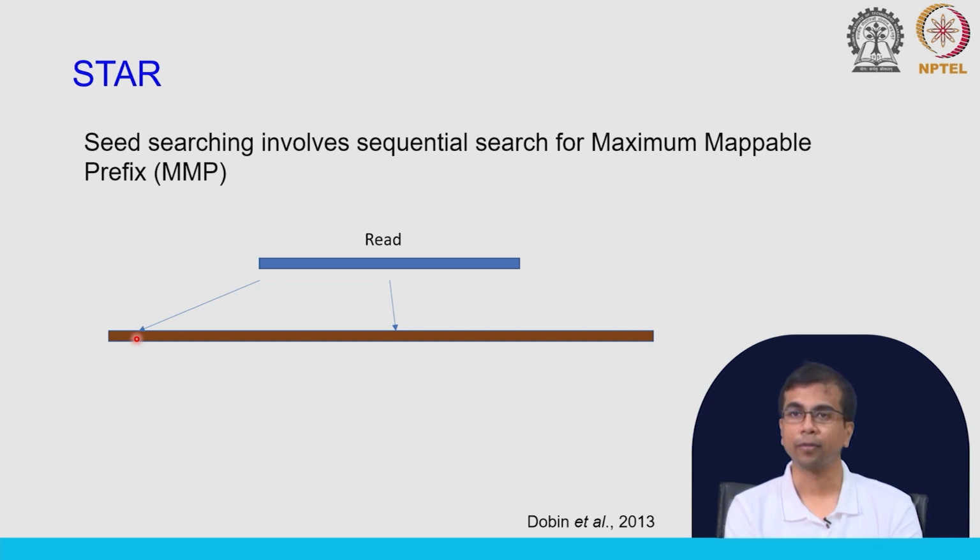We talked about this before. What it means is that it is trying to extend the alignment across the genome, and let us say up to this point here it finds a match, and after that the quality of the alignment falls. This is expected for RNA-seq data, because we need to have this gapped alignment, and the spliced-out regions will not be part of the read, because they are not part of the processed RNA.